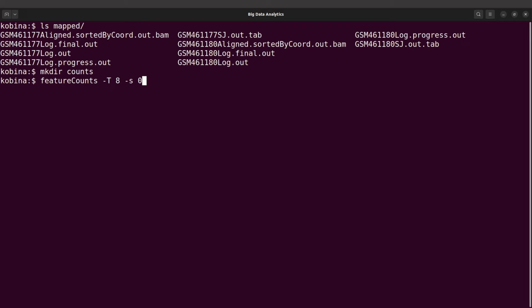One such tool is mentioned in the Galaxy tutorial page, the tutorial that I based this very tutorial on. So that Galaxy tutorial page has a tool that also allows you to estimate the strandedness. So just make sure to check that tutorial out and you'll find the tool there. There are other approaches, but ideally these two should serve as a starting point for you.